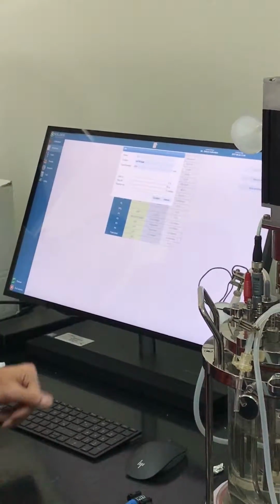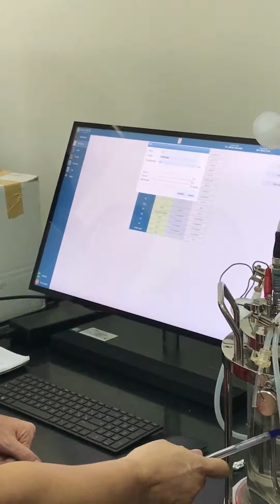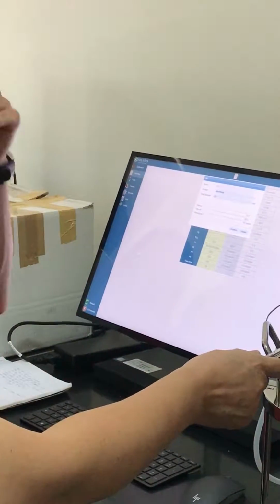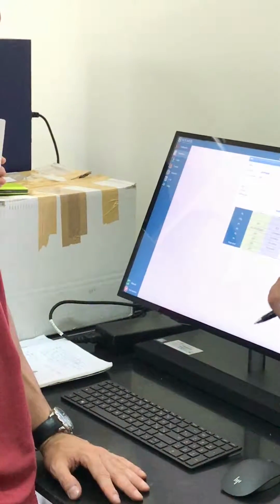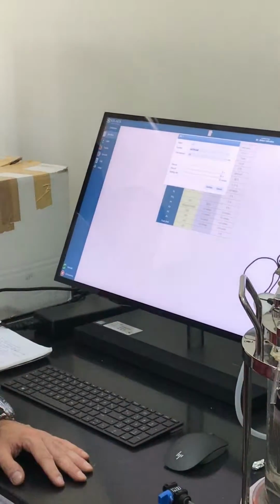Còn bình thường, lúc ví dụ như đang lên men, thì bọt nó lên sát đây thì nó chỉ dính vào cái sensor này thôi đúng không? Vâng. Còn cái đầu này chỉ là để tiếp đất. Khi bọt lên đây thì nó sẽ đóng cái mạch này, đóng mạch thì cái bơm sẽ chạy đúng không?